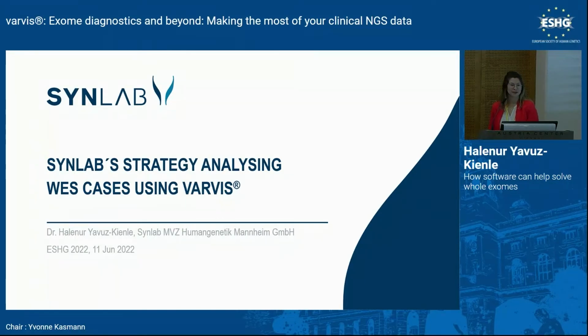And I want to kickstart this session by introducing to you some of the cases that we were solving using the varvis software, what kind of strategies we used, and demonstrate this with the case examples that I brought with me today.